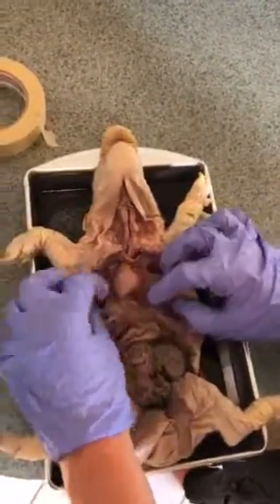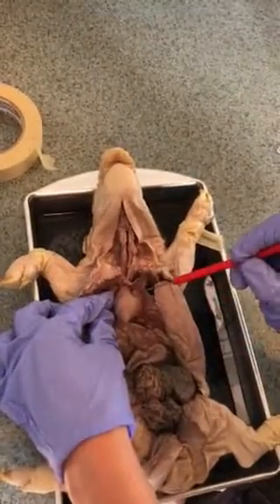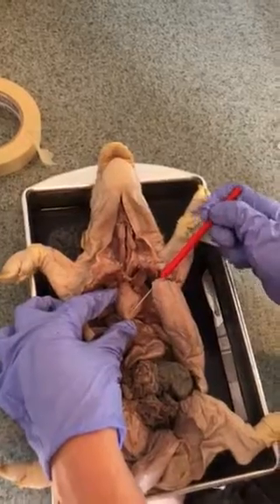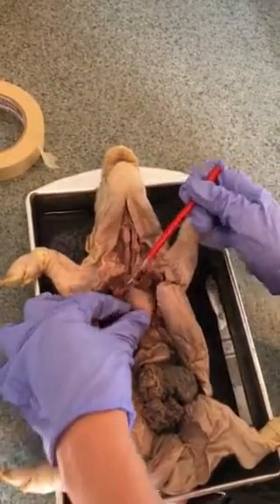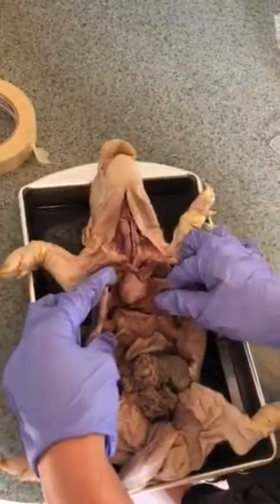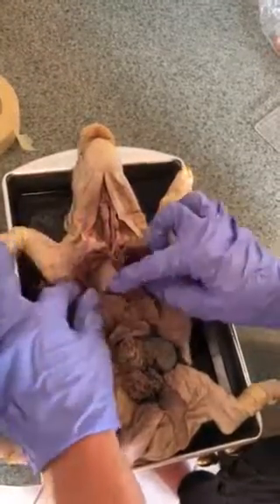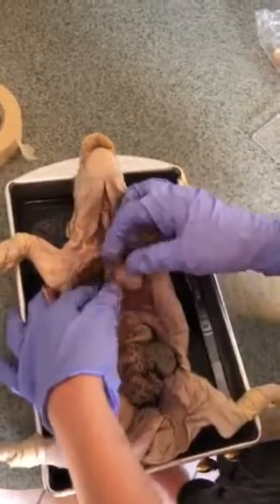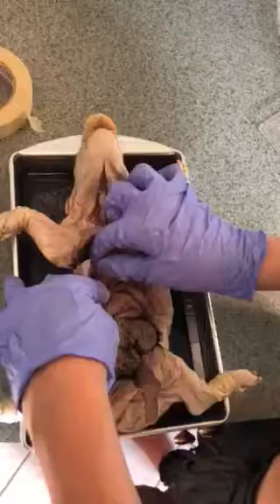And then we got the heart. So we have the left atrium right here. Then we have the left ventricle. We have the right ventricle and the right atrium. We have the left lung with its two lobes, superior and inferior. We have the right lung with three lobes, which is kind of tucked under, actually.